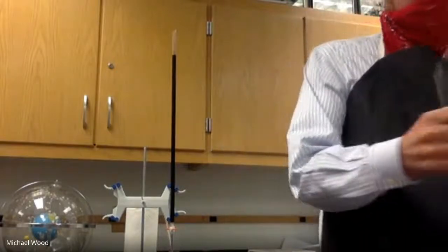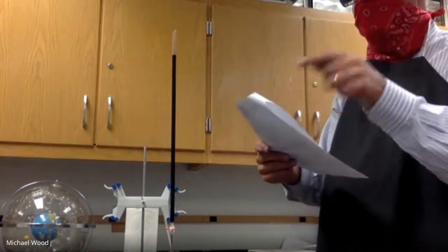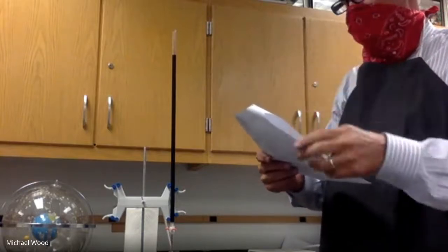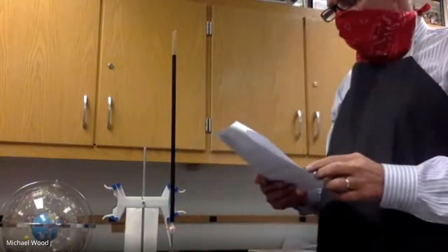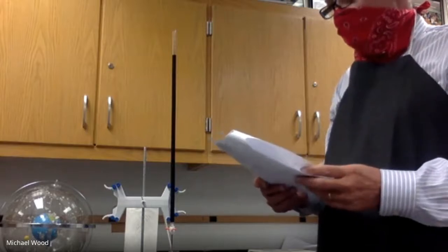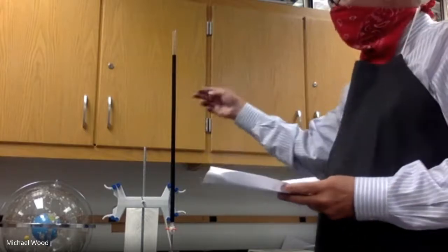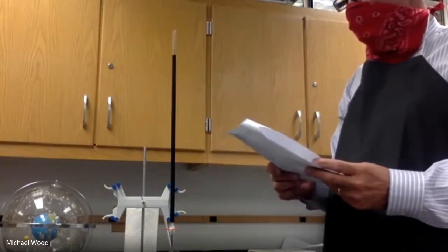I weighed out, it's actually 0.1993 grams. Then if you look on step 8, I put it in distilled water and in sulfuric acid. And now, like it says in step 9, I want to slowly titrate with the KMnO4. That's the purple stuff. Until we get to a faint pink color.